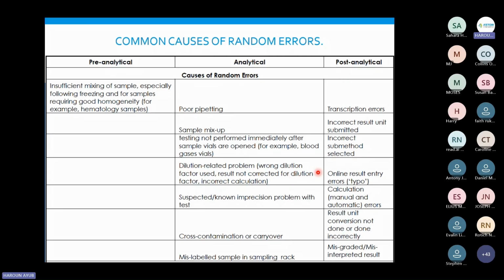Dilution-related problems, so wrong dilution factors. This is clearly well understood and important. Remember, a calibrated pipette is what we use at the lab. Do not use syringes.